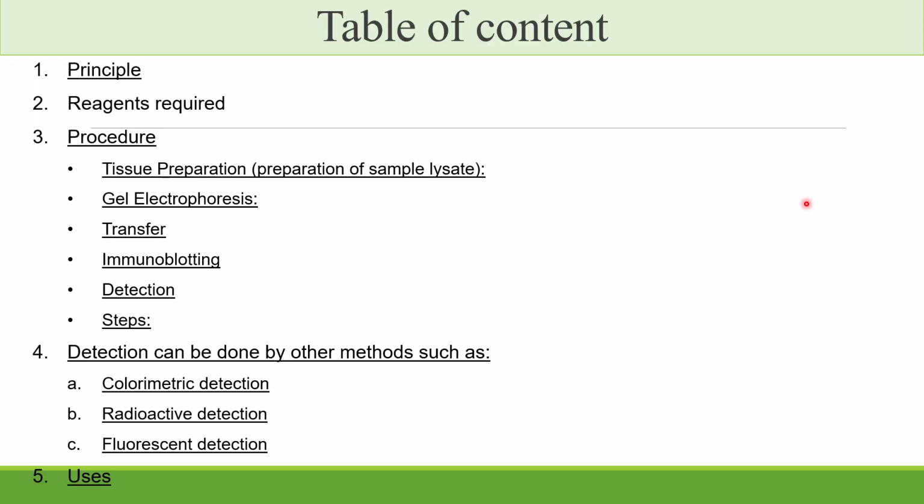Here is the table of contents of what we are going to discuss. First, we will be discussing the principles, reagents required, the procedure, detection methods, and their uses.